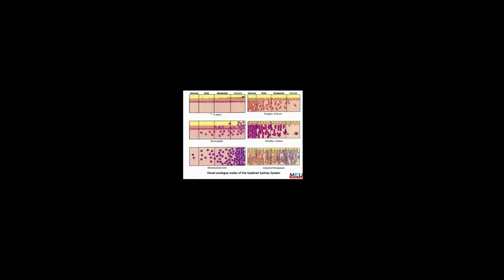For H. pylori, this is the normal without any H. pylori. Mild, occasionally we see the H. pylori here. The moderate, and marked when the H. pylori are increased.